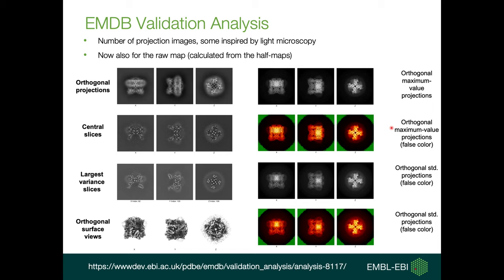In the map visualization area, we have orthogonal projections, central slices, largest variance, and orthogonal surface views. We also have newly created images like orthogonal max value projection, orthogonal max value projection in false color, and orthogonal standard deviation projection with its false-colored images. Those false-colored images are inspired by light microscope images. This allows visual assessment of internal details, with which you can check if a particle exists in the map, if any mask has been applied, and check some internal details.